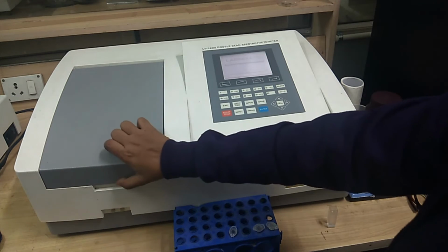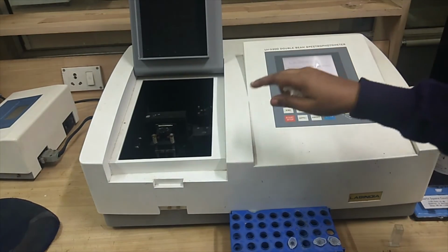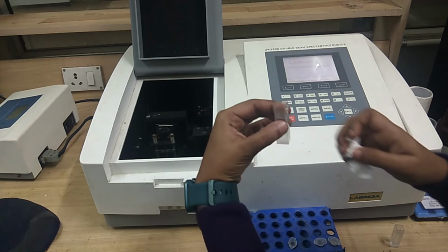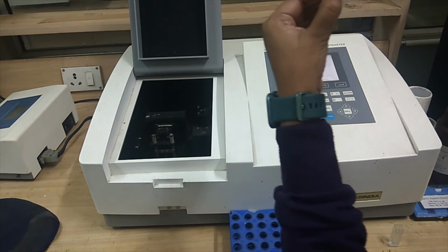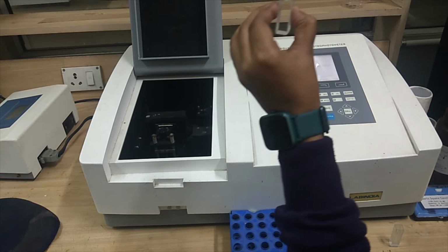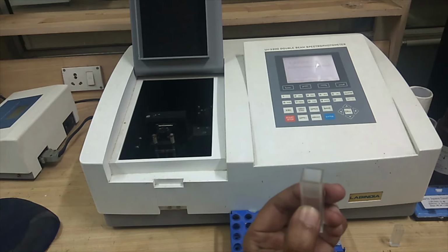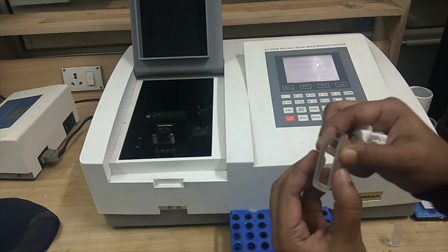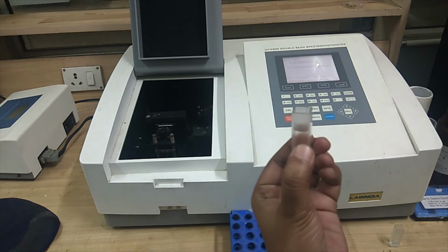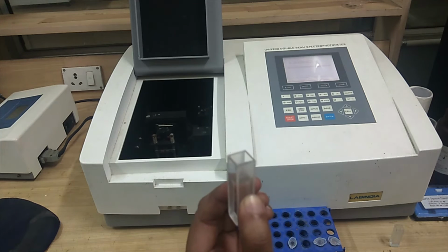And as I said, since the system always works by keeping a reference sample, we will put in these cuvettes. Cuvettes are basically the transparent vessels in which the analysis takes place. These cuvettes are made of quartz, plastic or glass. The one I am using right now is quartz, which can always be used in the UV or visible range.